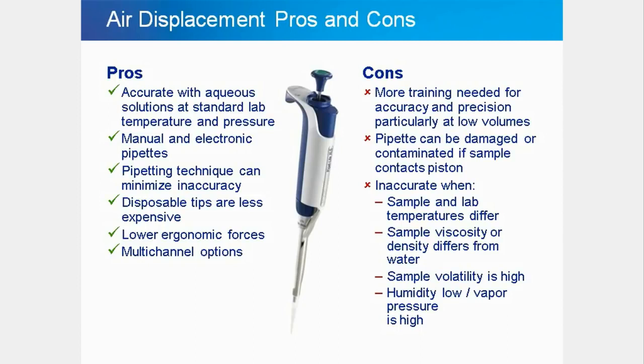Negative aspects are, they require more training to achieve accurate results, particularly at low volumes. The pipette can be damaged or contaminated if the sample contacts the piston.